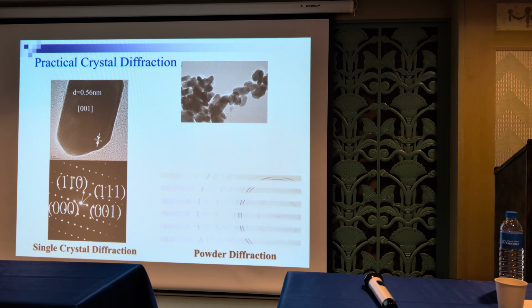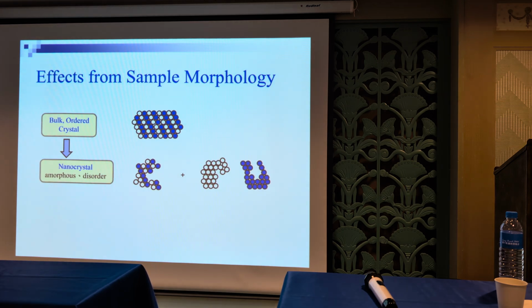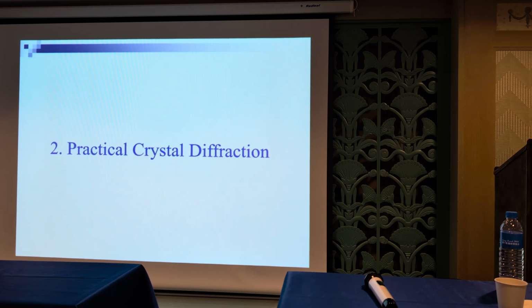So this is the case. This is the powder diffraction pattern. I got this data from the synchrotron radiation center. So that will give you a diffraction peak like this one.